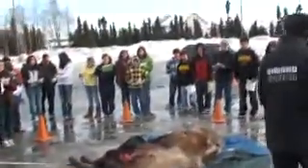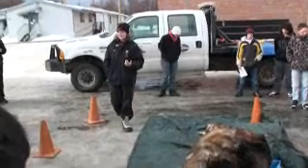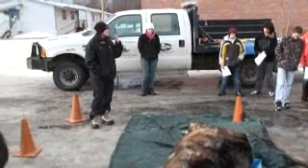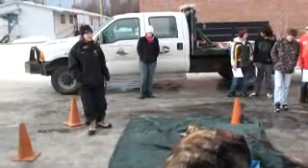The moose's lifespan goes up to about 15 years. We don't know the exact age of this moose, but we have ways to hypothesize about it, and one thing we look at is the teeth. In just a second, we'll lift the skull up and you can look at the teeth. The more worn down the teeth are, the older the animal is. Moose don't have dentists to help protect their teeth. When they're continually eating and grinding the teeth, which are bone, they're grinding that bone away, so the older they are, the more worn down their teeth get.